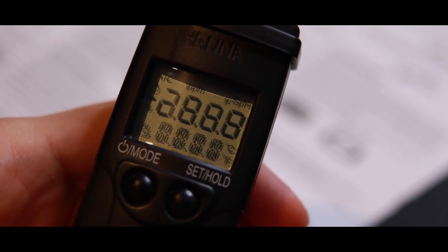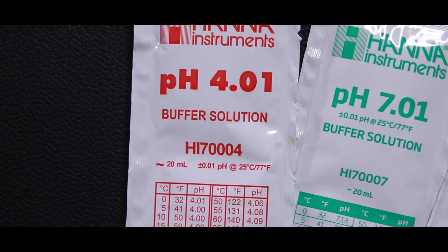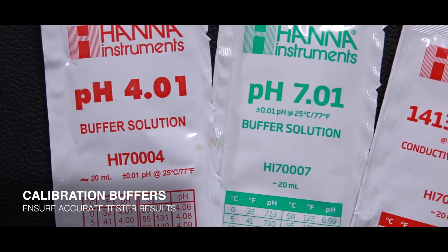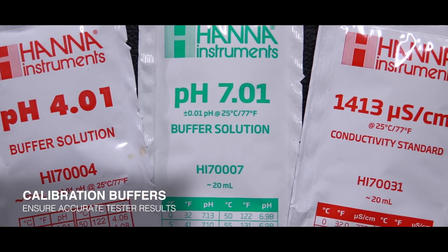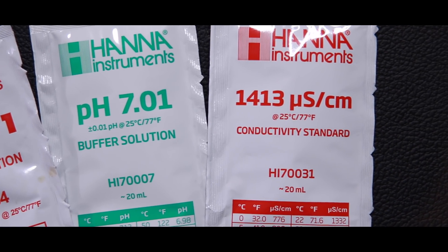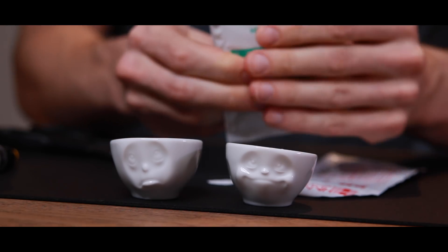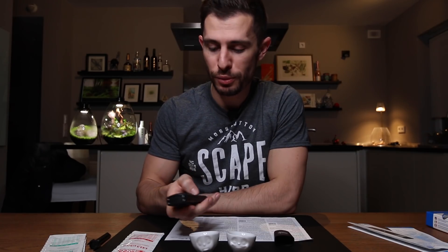Next, let's power on the device and see what the next steps are going to be. I have a little cheat sheet here that says we have to choose the calibration liquid. These three are necessary to properly calibrate it — I'm using the pH 4.01, the pH 7.01, and something for the conductivity. I've placed these in tiny little cups that hold just about the exact necessary amount of liquid. Let's go into calibration mode.